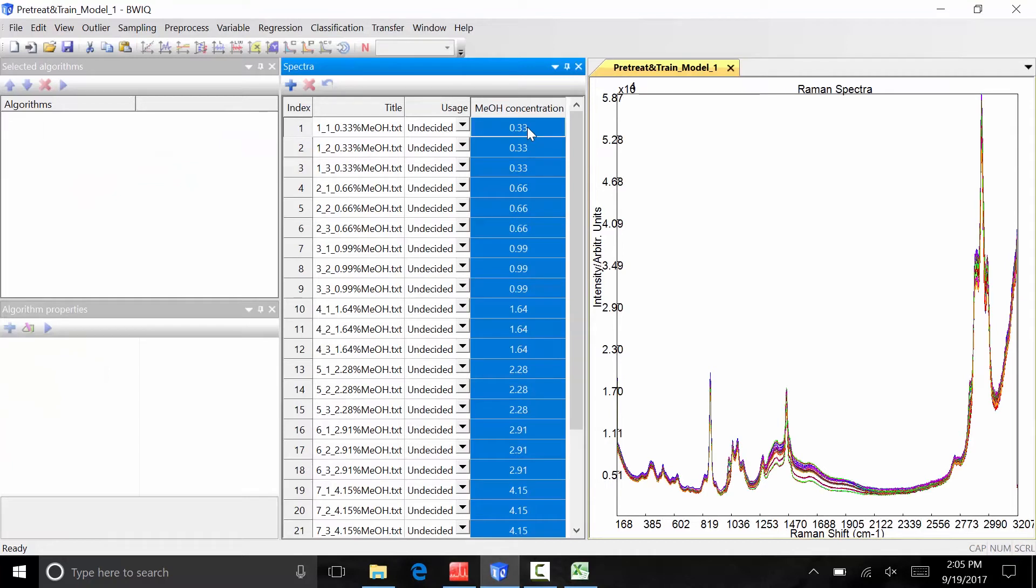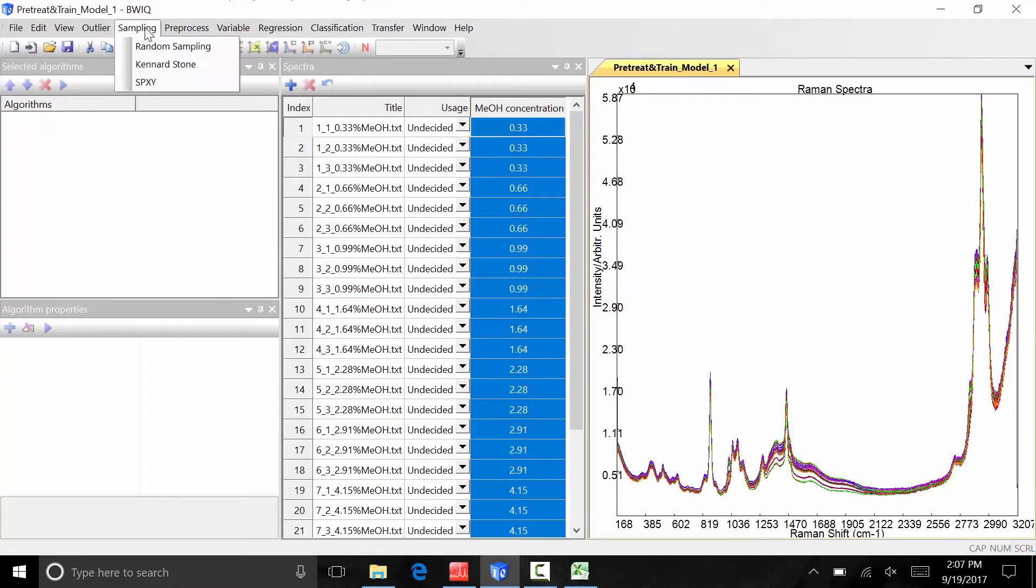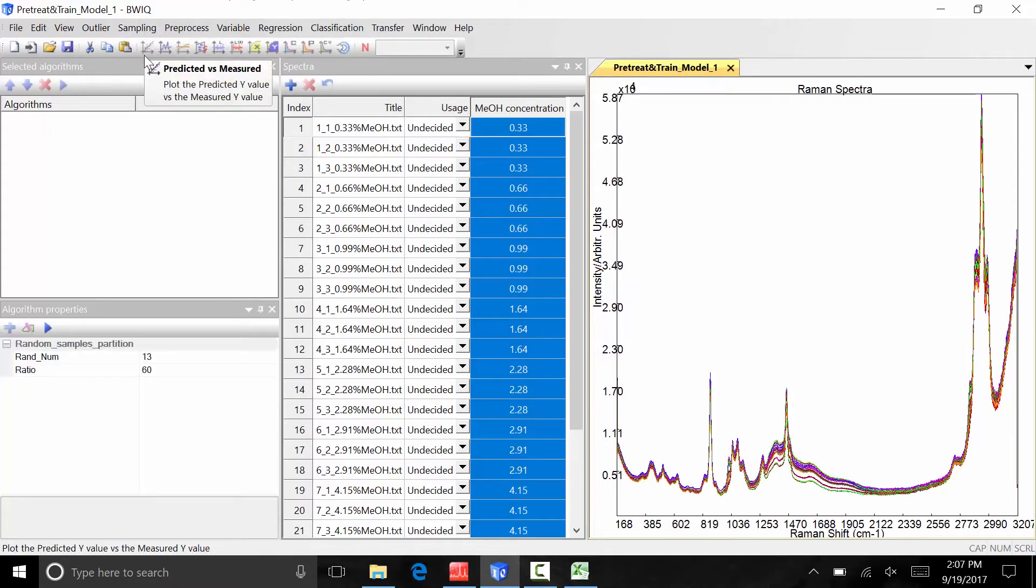Now that we have added variables to associate with our spectra, we will now apply a sampling algorithm to divide our 27 spectra into either calibration samples, samples we will use to build a calibration curve, or validation samples, samples we will use as a check to make sure the calibration curve is functioning properly. For this model, we will use a random sampling algorithm to randomly assign calibration and validation files. To select a sampling algorithm, click sampling, then random sampling.